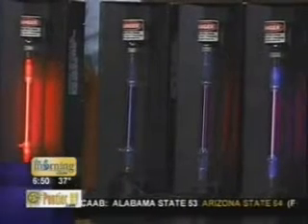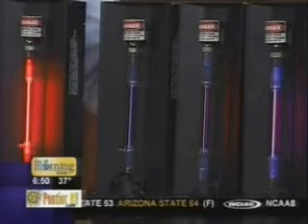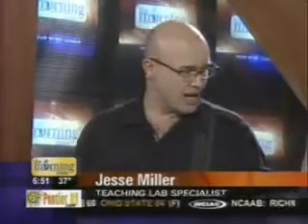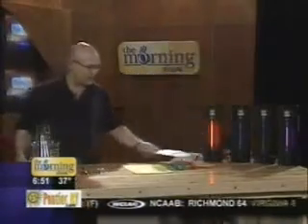Now, phosphorescence is very similar, except it kind of goes into this quantum holding pattern, if you will, and then it takes longer. Instead of de-exciting in picoseconds, it goes in seconds and minutes and things like that. Now, go ahead and turn that off. Okay. It makes me nervous.